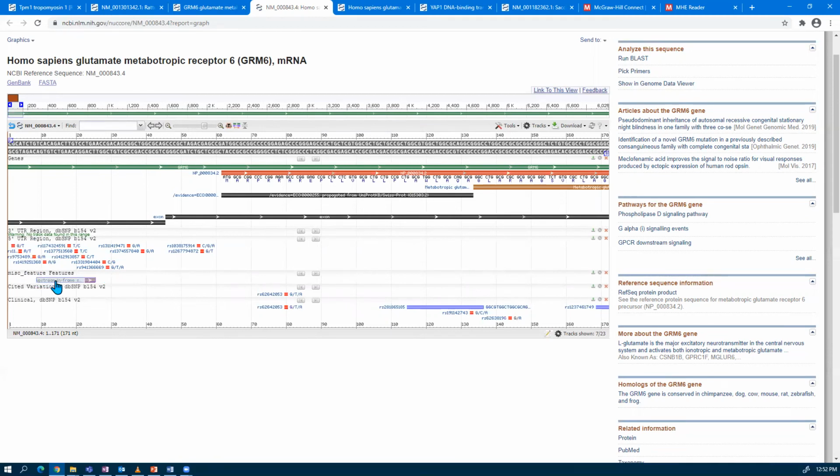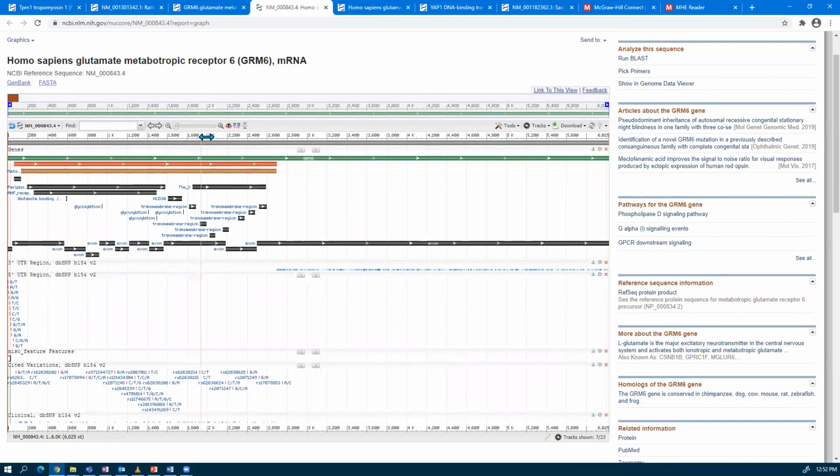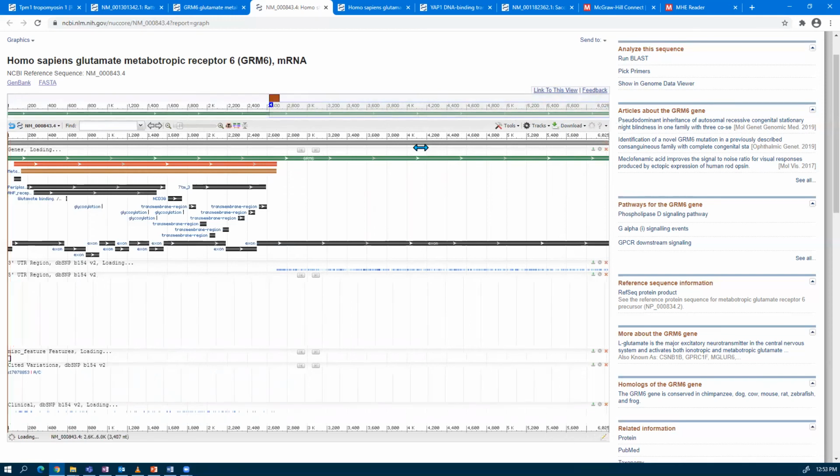There is also a similar feature, an upstream in-frame stop codon, again within the untranslated region. If you click on it there, you can confirm TGA is indeed a stop codon. So let's zoom back out and have a look at the entire sequence again and zoom in into this region of your protein, find out exactly at what position it ends, and also determine the full length of the 3' untranslated region. So just scanning through this portion, and I'll just zoom in to make it much easier.